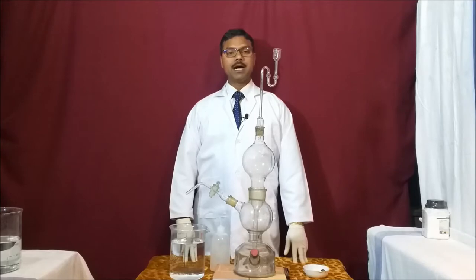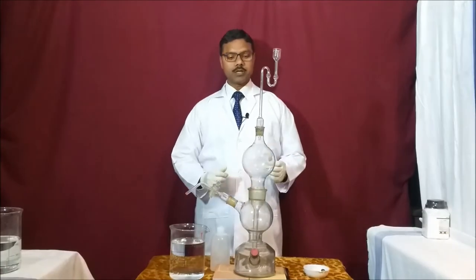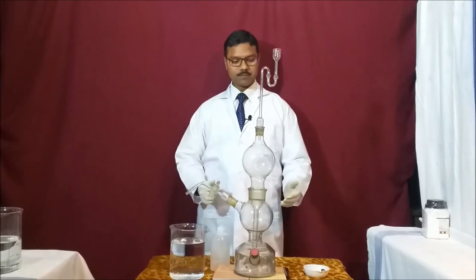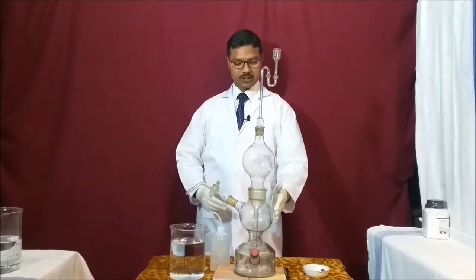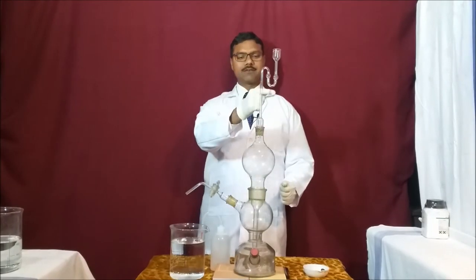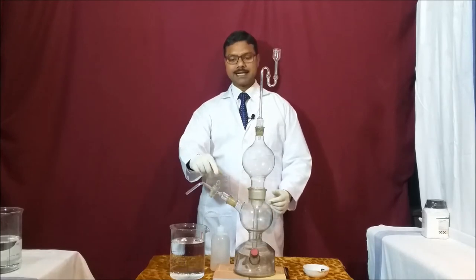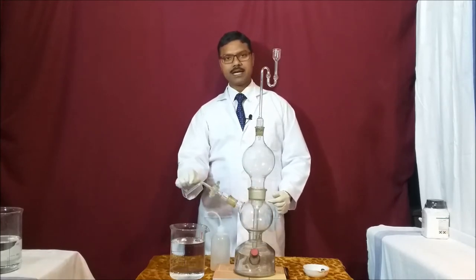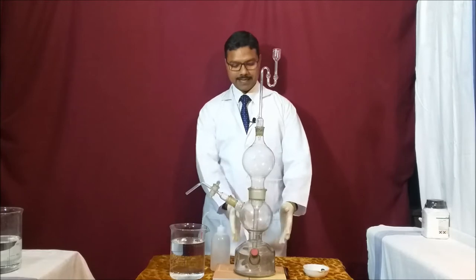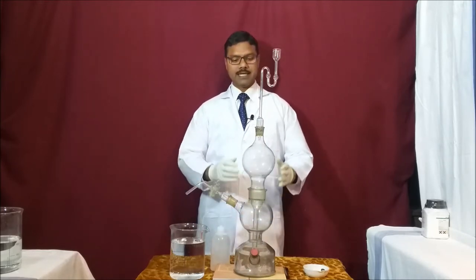Today with this apparatus I am going to show you how we prepare hydrogen sulfide gas. In this apparatus you can see there are three sections: section A, section B, and section C. Section A is connected with the thistle funnel, section B is connected with the gas outlet through which we take out our gases, and section C is used for filling the acid.